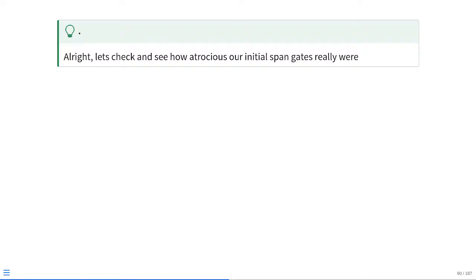So at this point, for our bead single color gating controls, through the use of these three or four different helper functions, we have basically automated a lot of those manual steps that were implemented back during the week 12 spectral signatures walkthrough. So let's actually visualize these initial gates to see how good or how atrocious they may be.